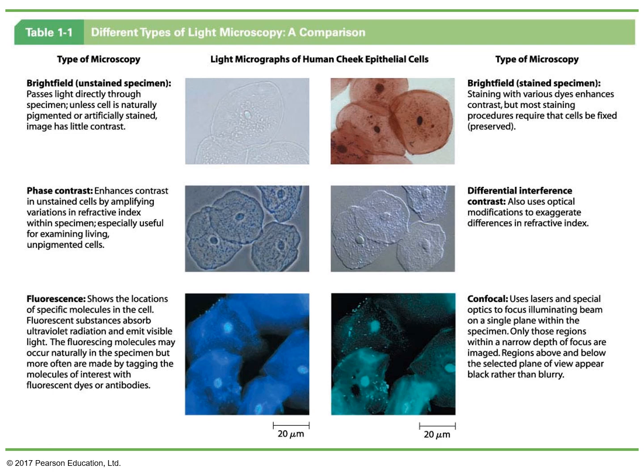Questions for the test will include pictures like these ones, and you have to tell me which one is bright field, which one is confocal microscopy, what you think is fluorescent microscopy, what is phase contrast. Hopefully I can have a practice test so you can practice, but a good way to start practicing is to read the textbook and see these types of pictures.